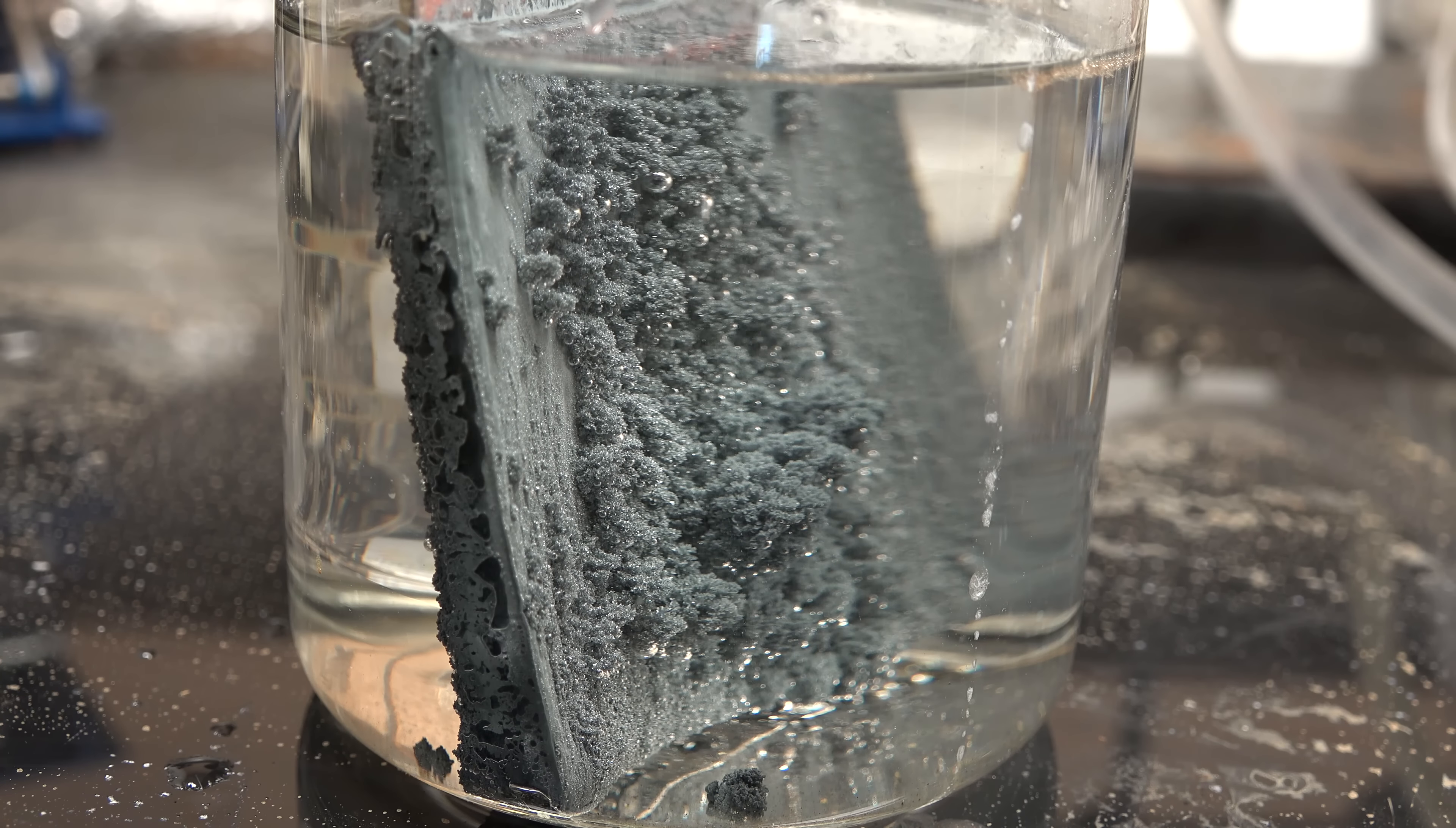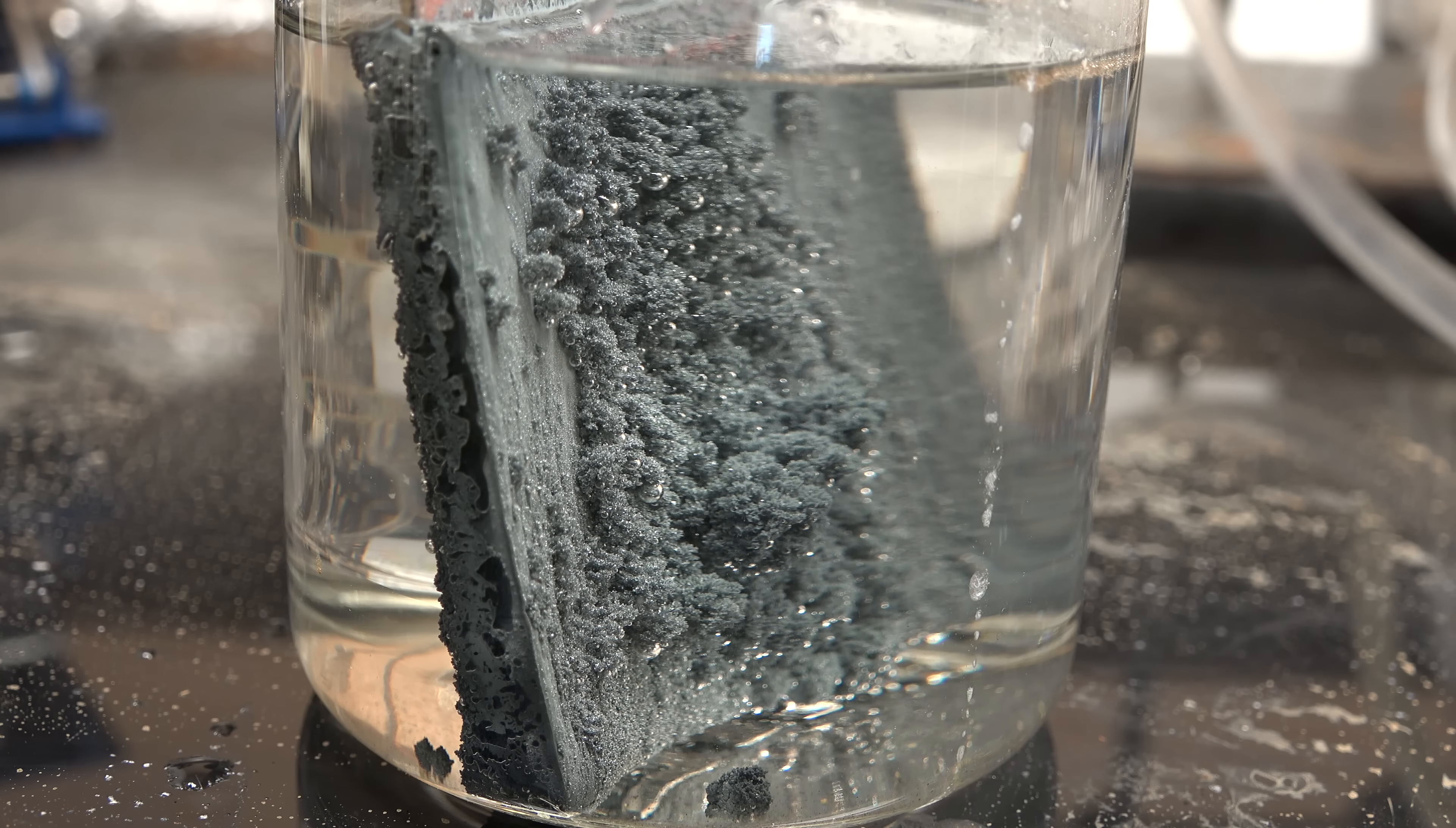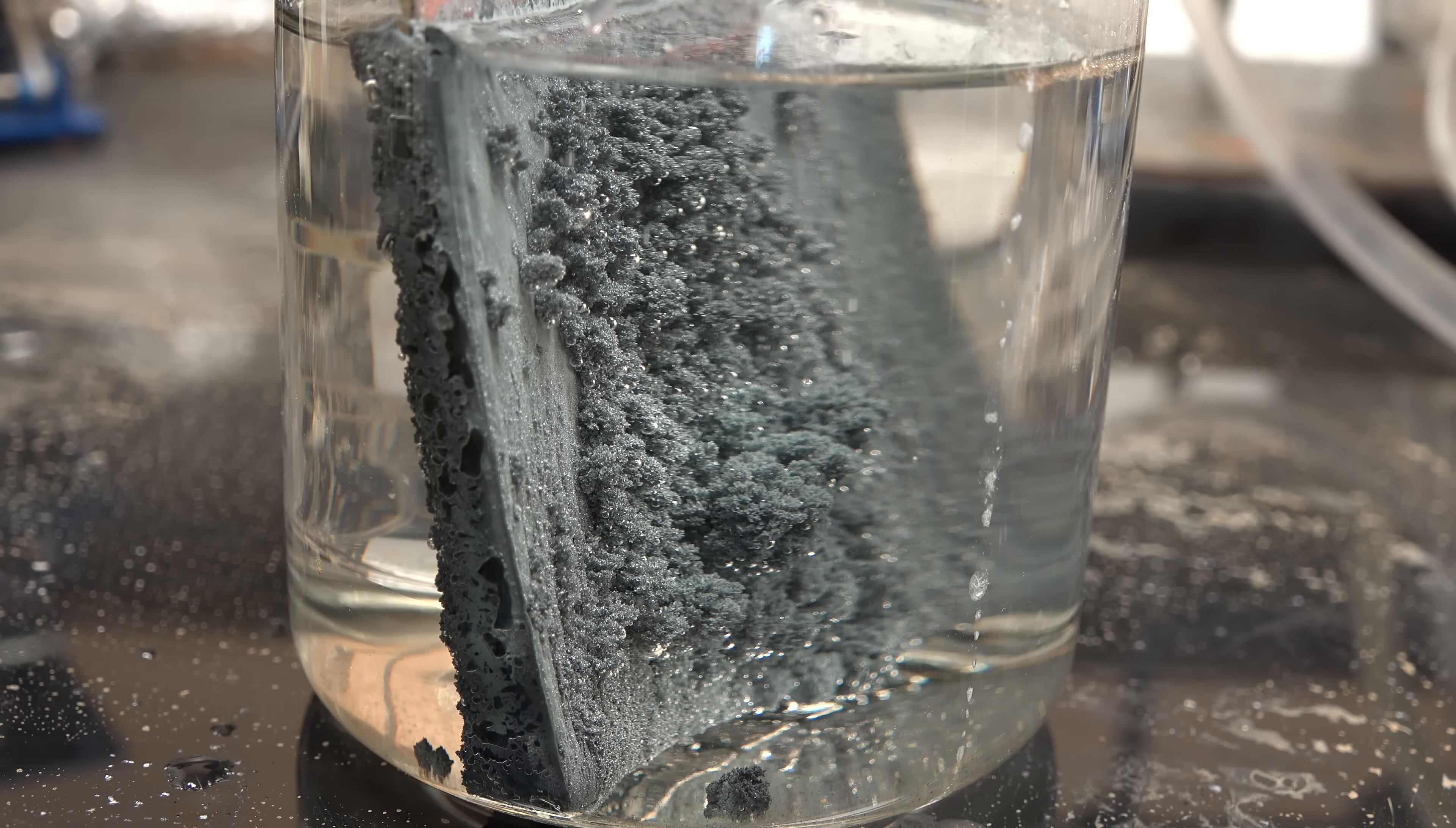This is because we've depleted the solution of zincate and now we're left with a concentrated solution of sodium hydroxide. Zinc actually reacts with concentrated sodium hydroxide to form sodium zincate again and hydrogen gas. Stopping the reaction is easy enough, remove it from the solution and give the zinc a good wash with water.